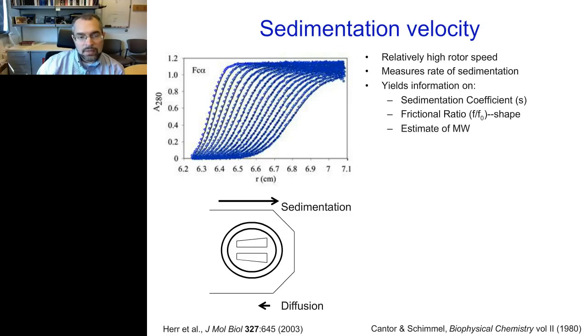So here on the left, this represents the portion of the sample compartment that is closest to the center of the rotor, and we're always going to be looking at this from the perspective of the inside on the left, and the protein is always going to be traveling toward the right. And then eventually the protein will sediment all the way through the sample cell and will crash into the back wall of the sample compartment, and that's what's referred to as clearing the meniscus, where we can see the protein has gone all the way through, and the only thing left is basically our buffer blank.